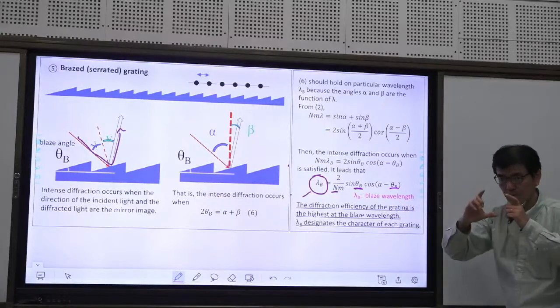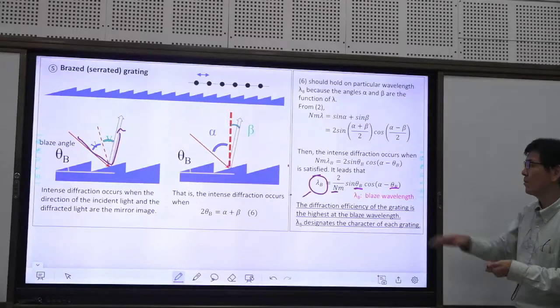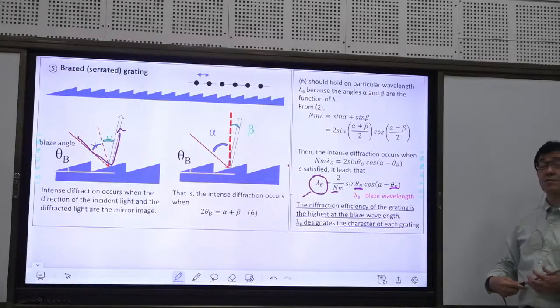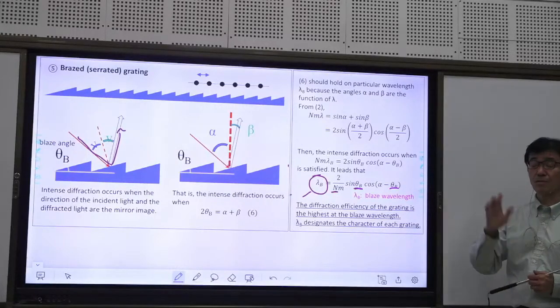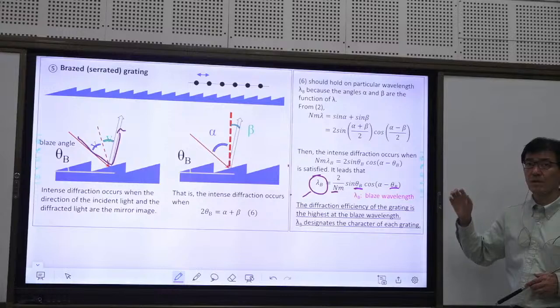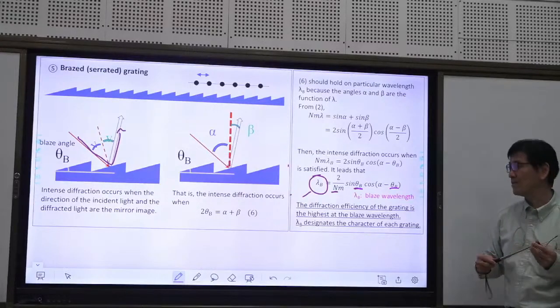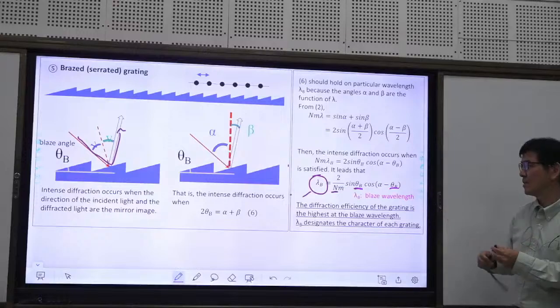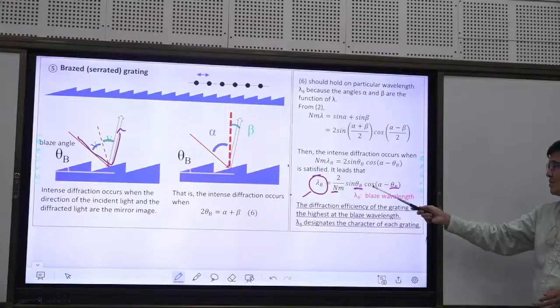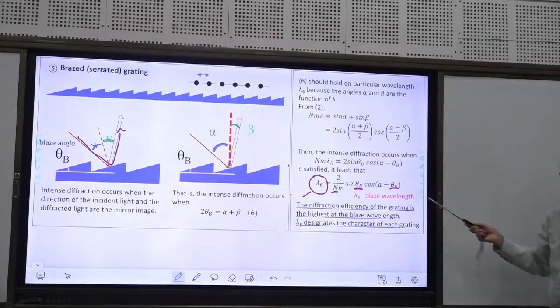That product is optimized for this wavelength. So if you want to measure 266 nanometer, do not purchase a blaze wavelength of 1000 nanometer or so. Please choose the grating having the closer blaze wavelength. It's better. It promises better performance for your condition.